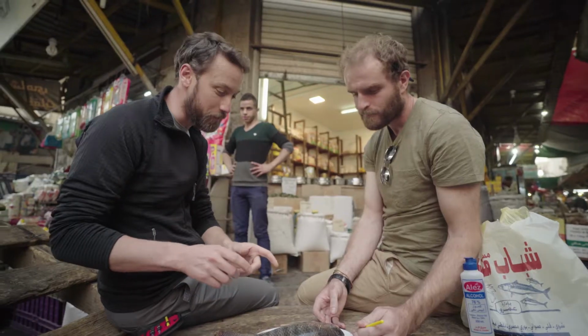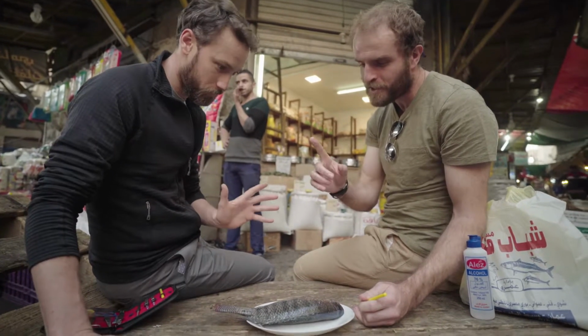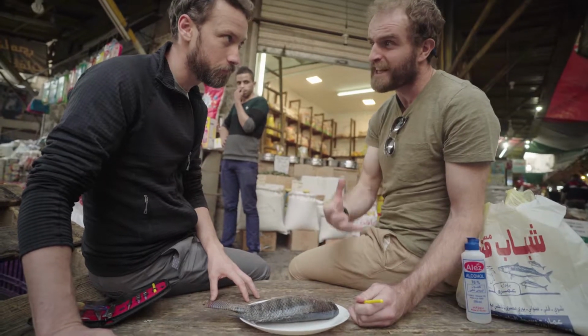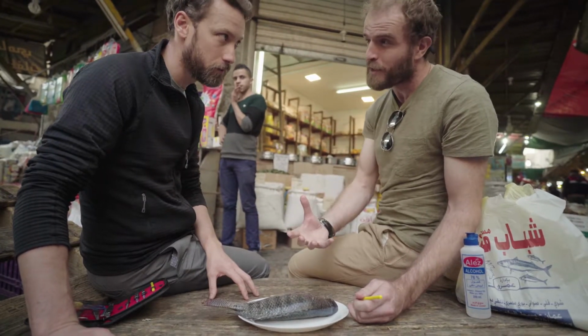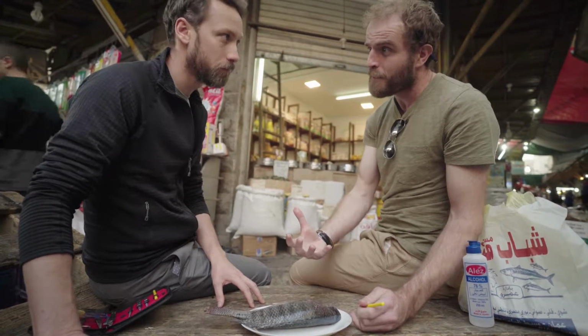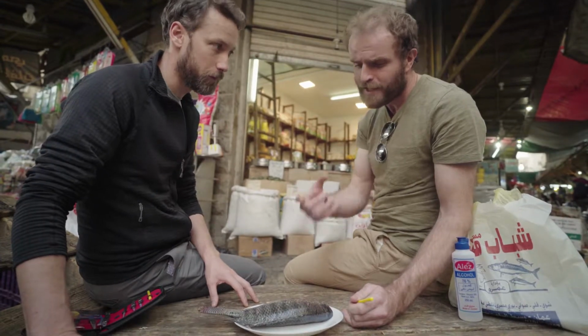Okay. Can you tell me, is there anything else we need to look at before we cut it up? Yeah, one more thing before we go diving. What's that? The mouth parts. With any animal, you can tell an awful lot about its ecology, what it eats, from the mouth parts. What can we tell? Well, if you were a horse, you'd have flat teeth for grinding plant material. If you're a lion, you have sharp teeth for tearing flesh and swallowing. So what do you reckon?